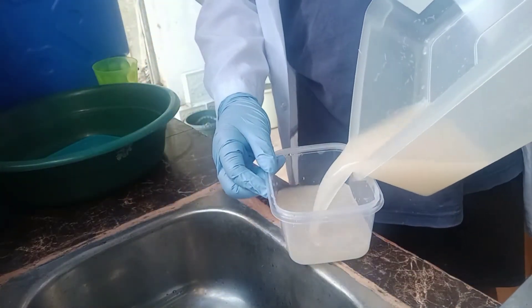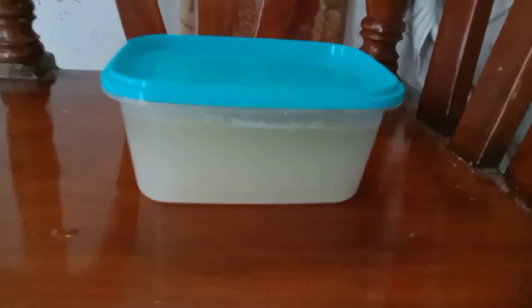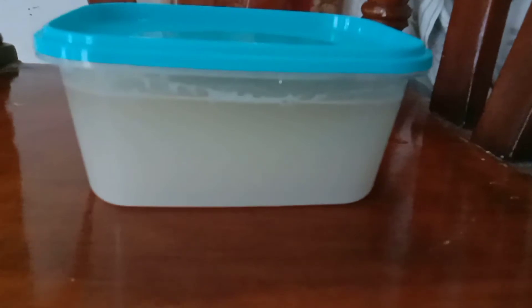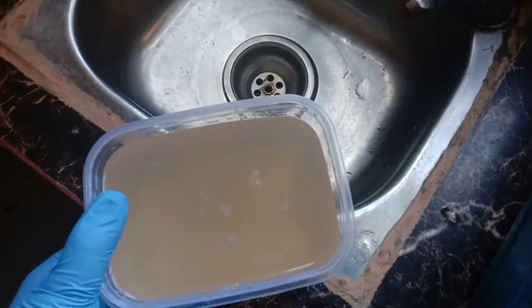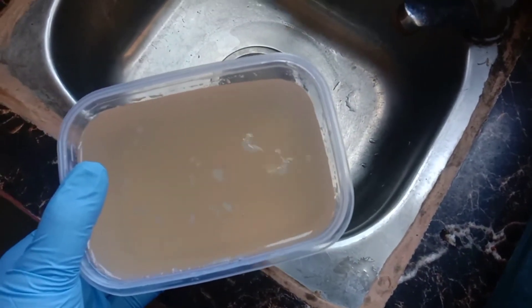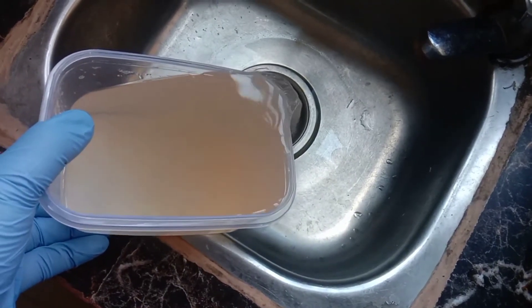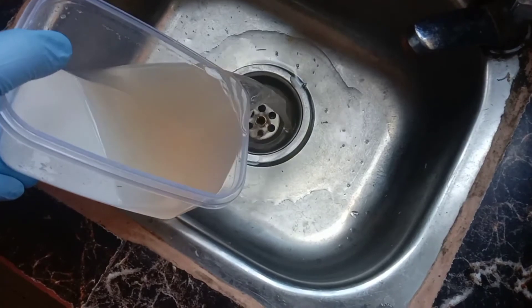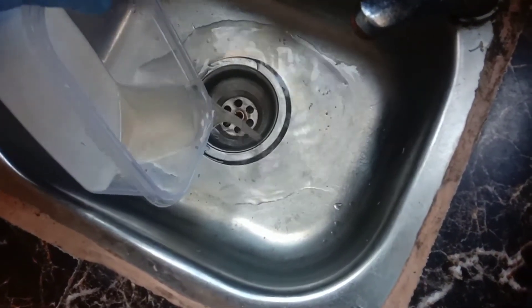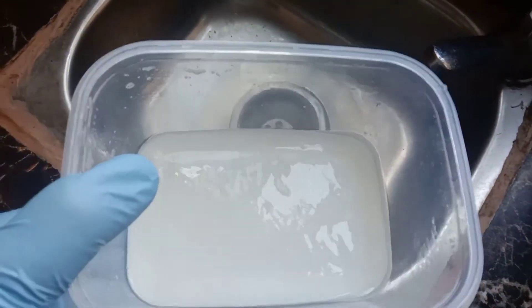We will now place the mixture into a smaller container for it to settle down. We will let this mixture sit for hours for the mixture to separate. We will then remove the top water again until it turns clear, as an indication that the starch is already clean. You can change the top water as many times as you want, as long as the starch is clean.